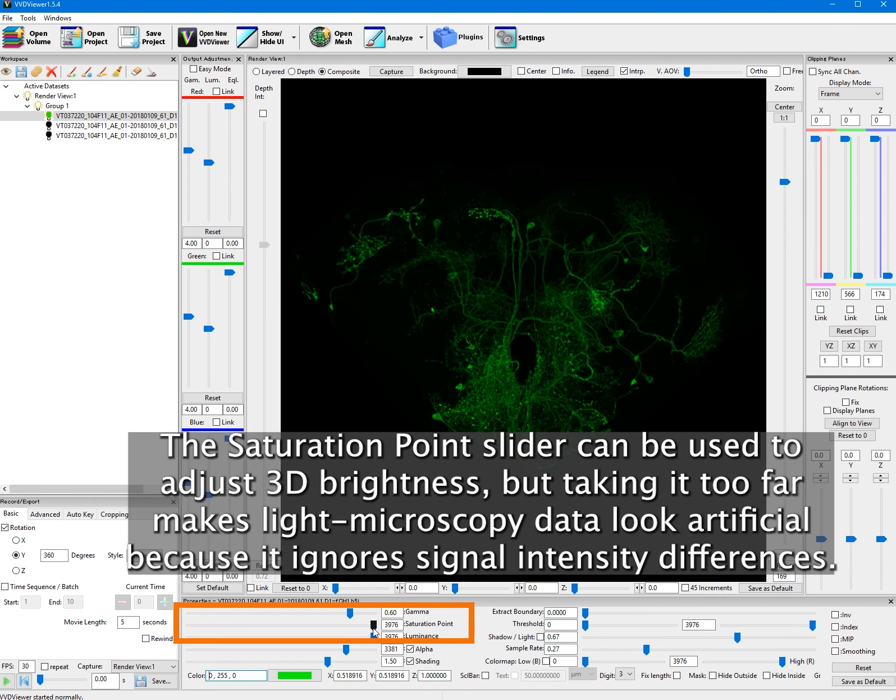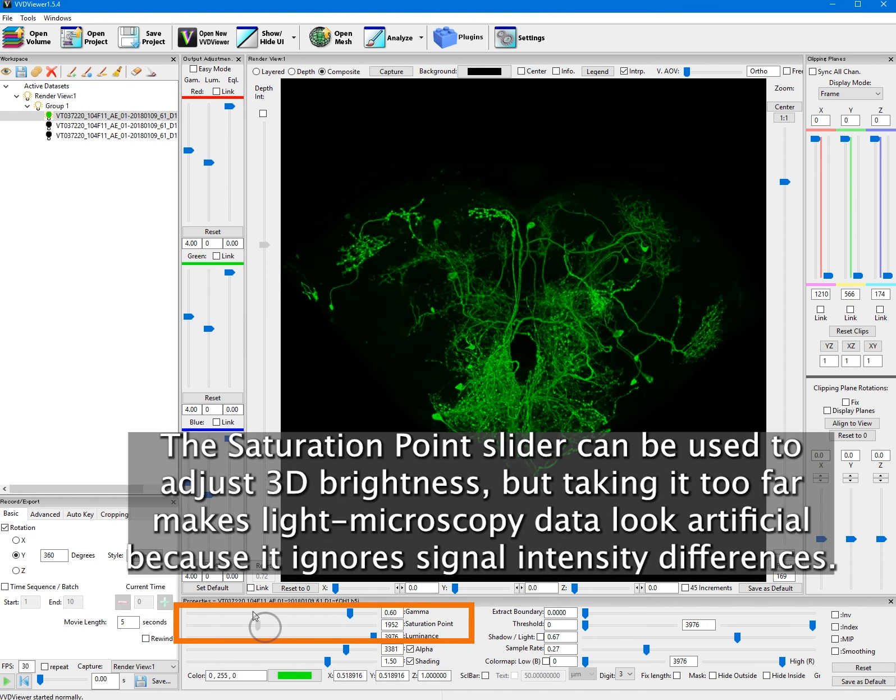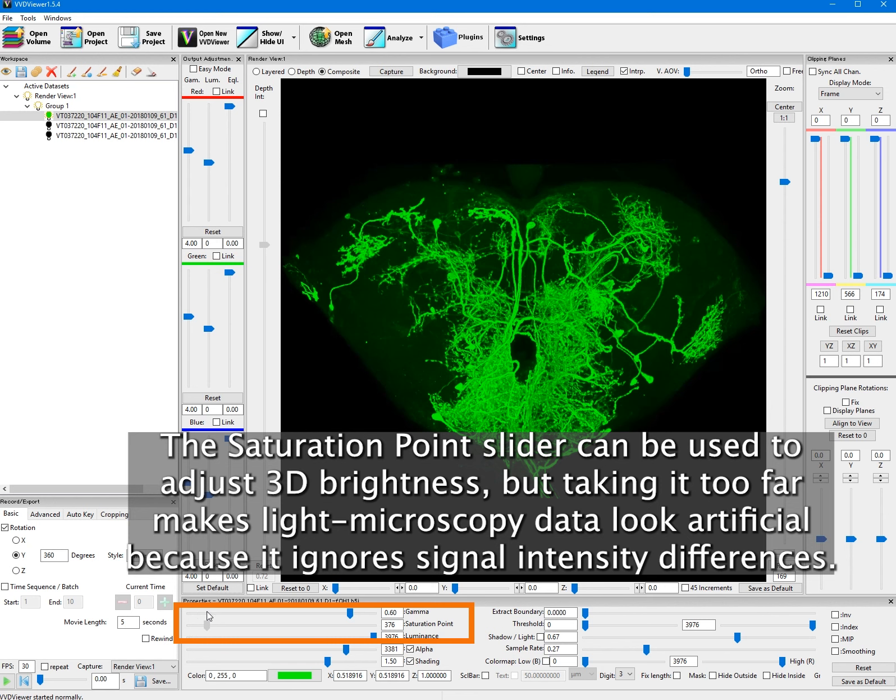The saturation point slider can be used to adjust 3D brightness, but taking it too far makes light microscopy data look artificial because it ignores signal intensity differences.